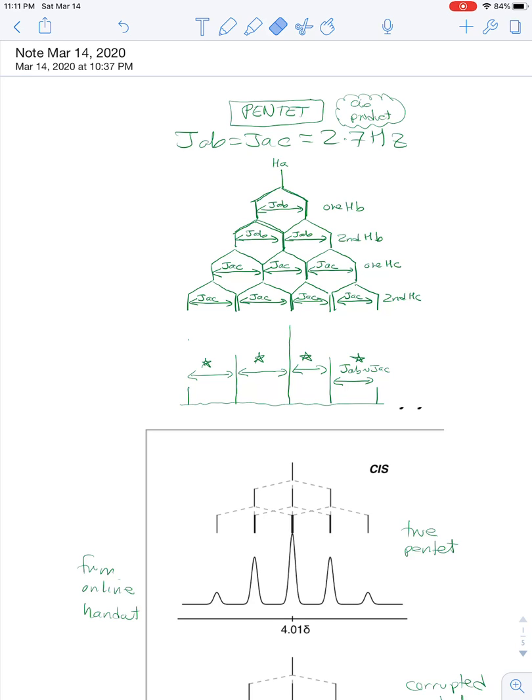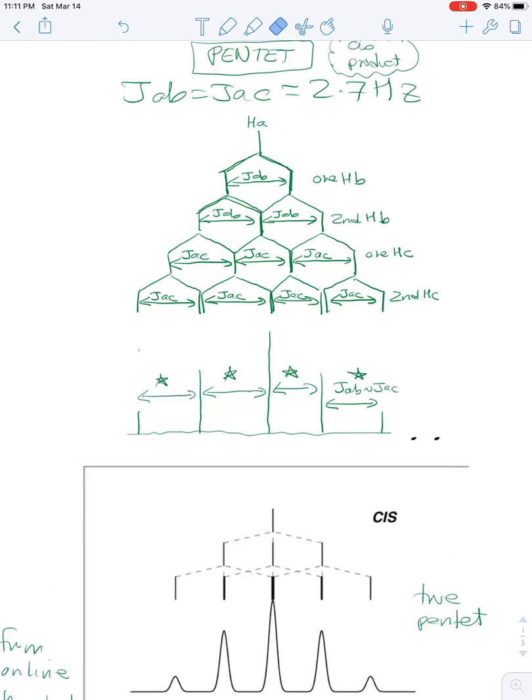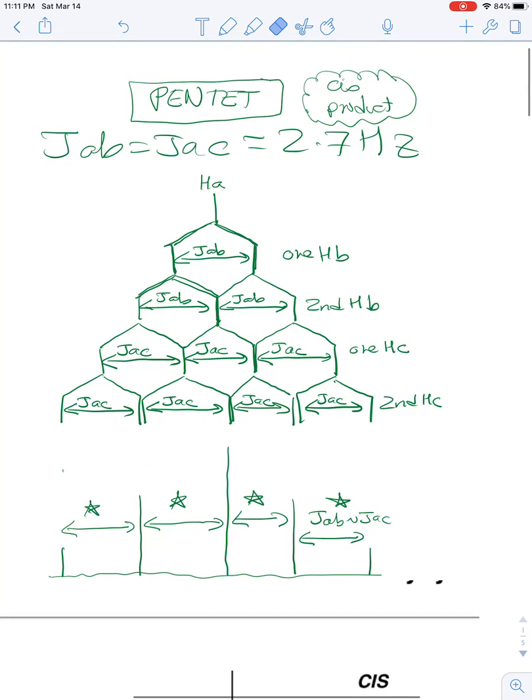We'll start again with the cis product and its pentet. I'm calling it a pentet because the two coupling constant values are the same, and that will give us a true pentet. We start with the center of the signal, and then we're going to go out equally in both directions.